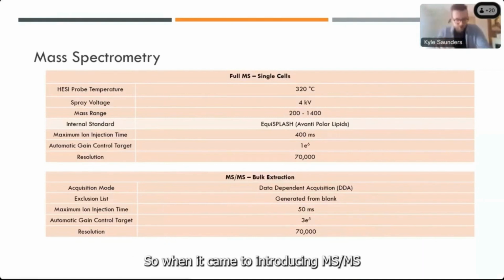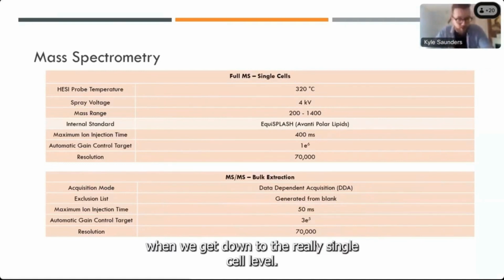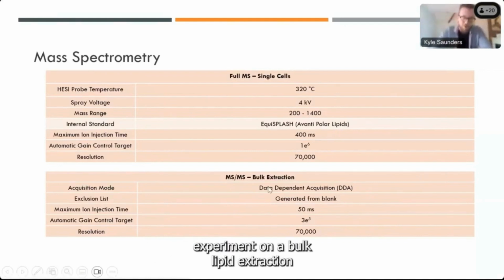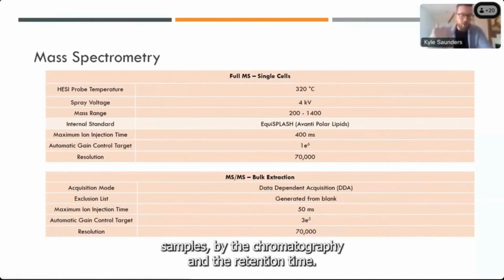So when it came to introducing MS/MS experiments in there as well, it lost sensitivity when we get down to the really single cell level. So to compensate for that, we performed our MS/MS experiments on a bulk lipid extraction, so that we could then translate that back to the single cell samples by the chromatography retention time.